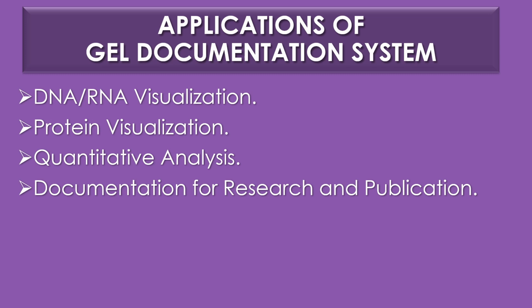Applications of gel documentation system. There are 4 applications of gel documentation system. The first application is DNA or RNA visualization. Gel doc systems are primarily used in molecular biology to visualize DNA or RNA fragments which are separated by electrophoresis. This includes applications such as PCR product analysis, restriction digestion analysis, and gel purified DNA quantification.